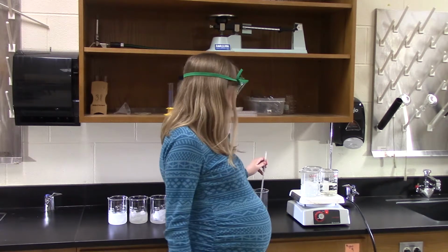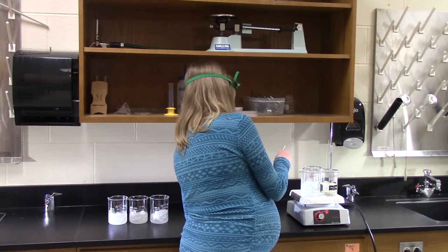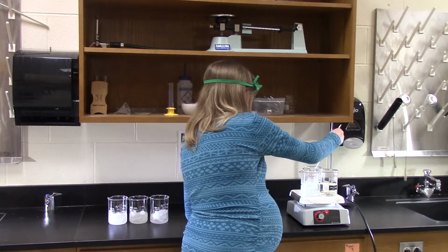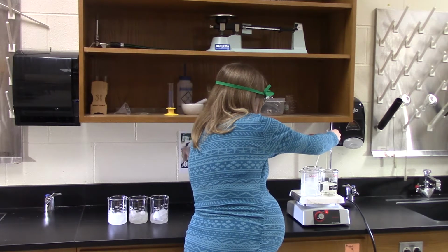Okay, now since salt is ionic, it's an electrolyte, it breaks apart into its ions, we should be seeing a higher boiling temperature. Let's see if we see something different here. So when I measure the salt, okay, let's see, we should be seeing one higher than 100.